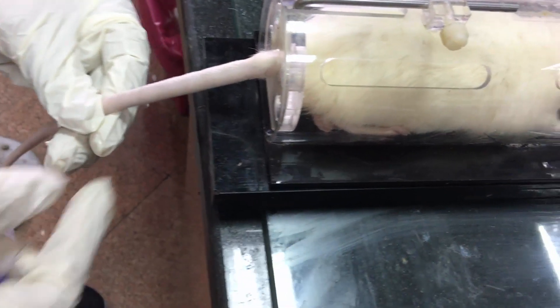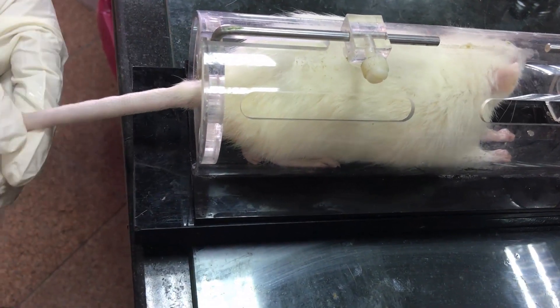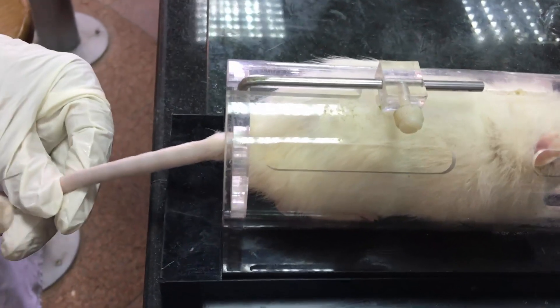Steps of tail vein blood collection. First, the animal should be restrained. Put the animal in a restrainer and clean the tail with alcohol. Warm the animal's tail with a heat lamp or massage to dilate and congest blood vessels.